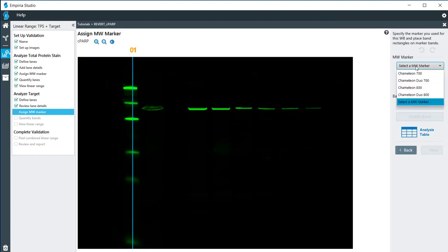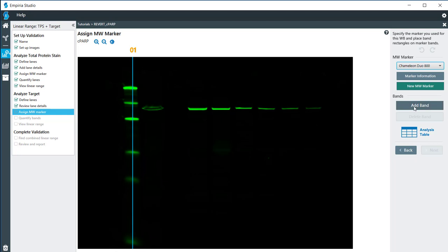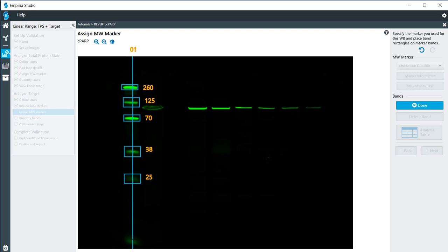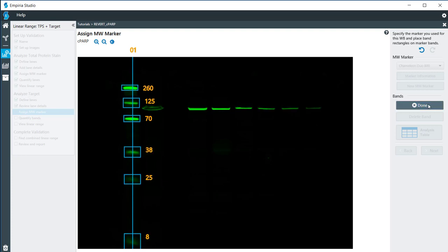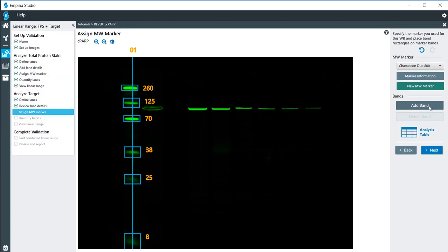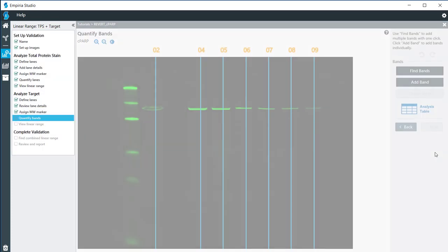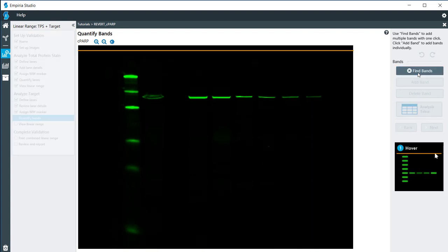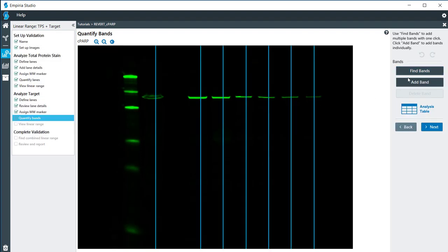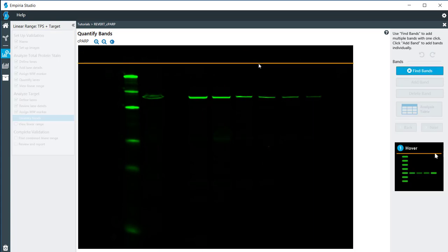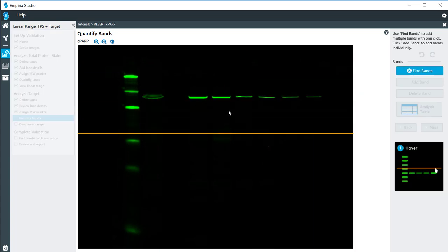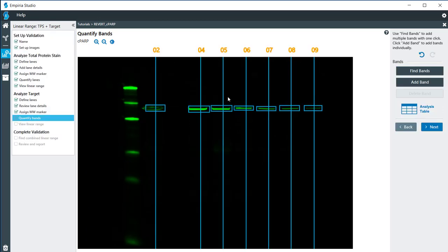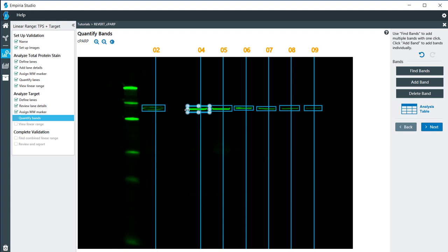For molecular weights I'm going to choose the chameleon 800 duo. I'm going to add the molecular weight bands by clicking the add band just to the right there. Now you click done and then we'll go to the next window. For the fine bands you can either add the bands individually or you can find all the bands together. I'm going to click on fine bands and then move this line to just over the sample bands. It will do the determination of the size and location of the box. If need be you can edit these if you need to make some adjustments. Once you have all of those in the correct location, click on next.